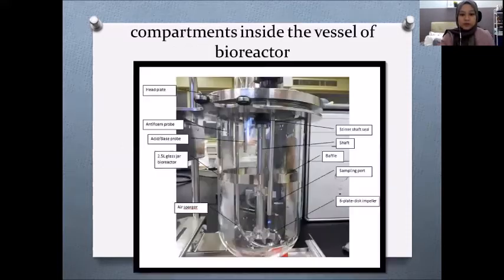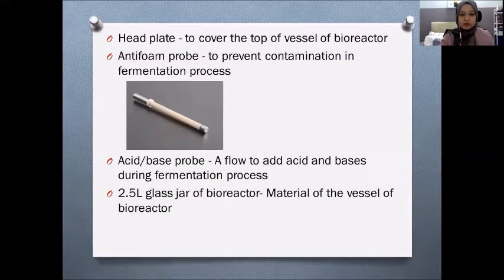Antifoam probe is to prevent contamination in the fermentation process. Acid-base probe is to add acid and bases during the fermentation process. And the glass jar of bioreactor is the material of the vessel of the bioreactor.